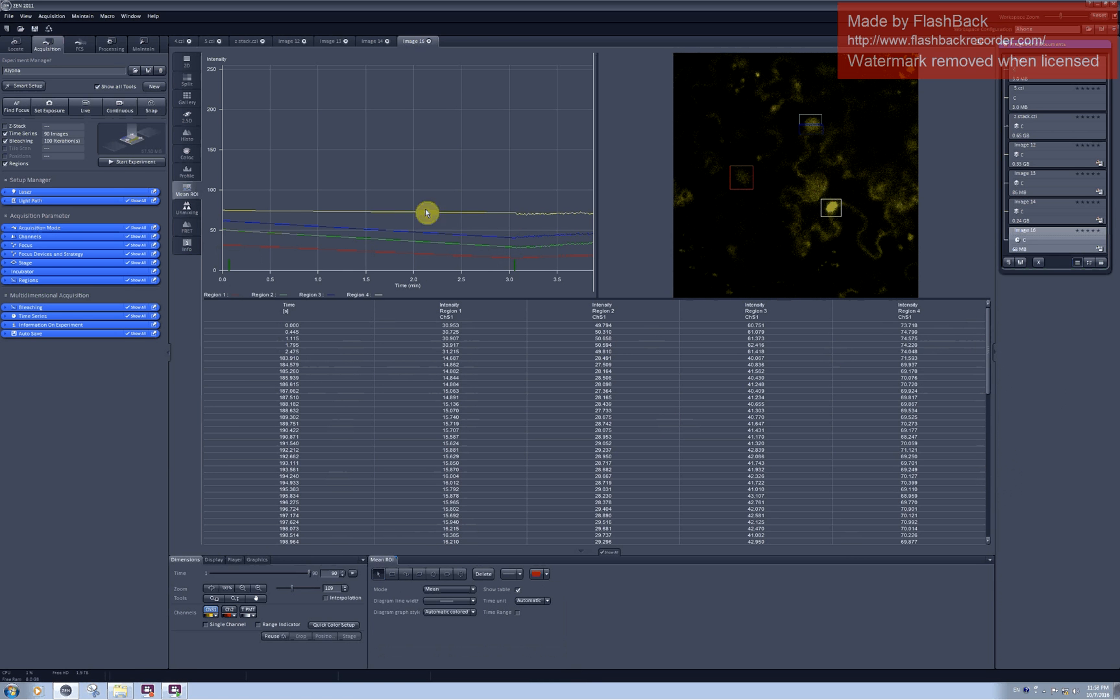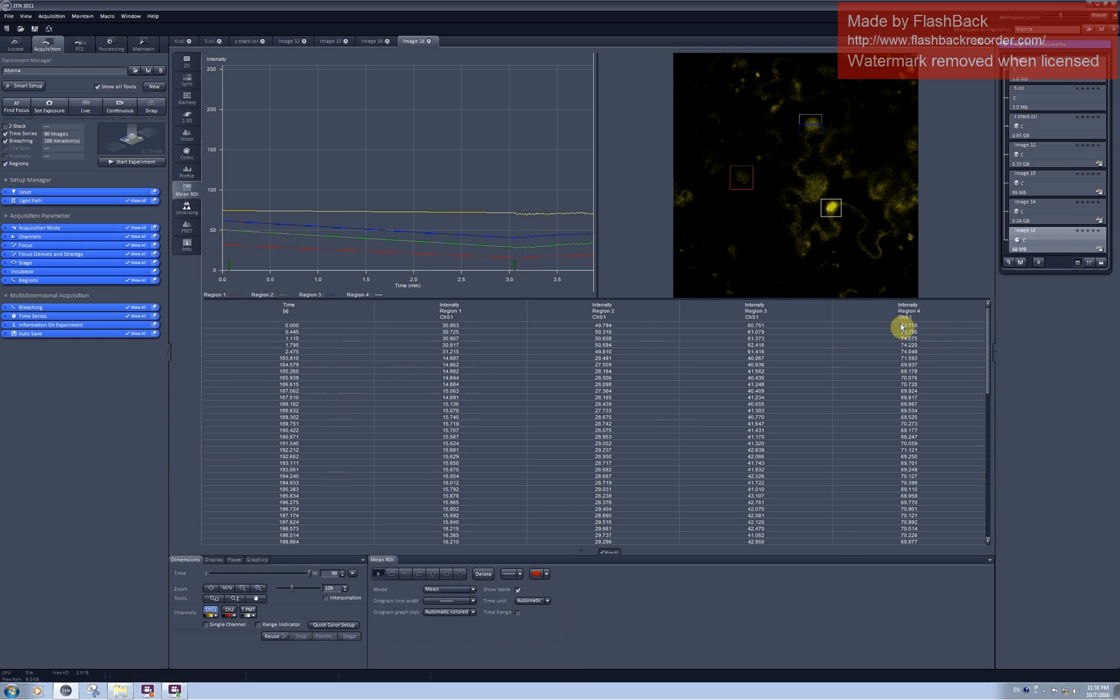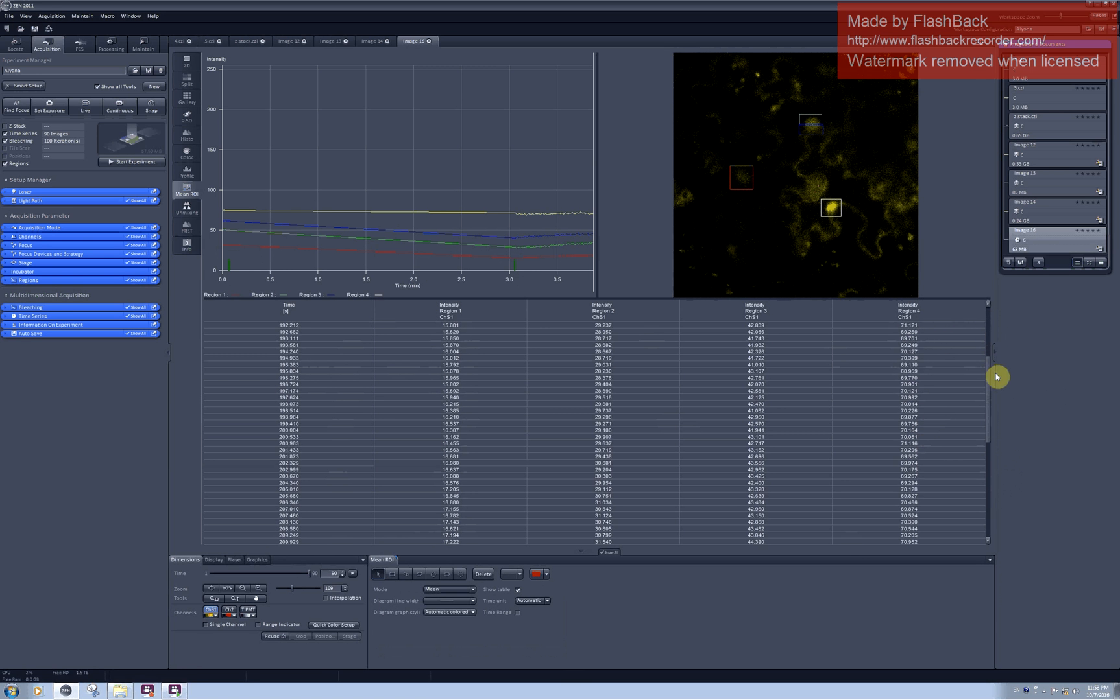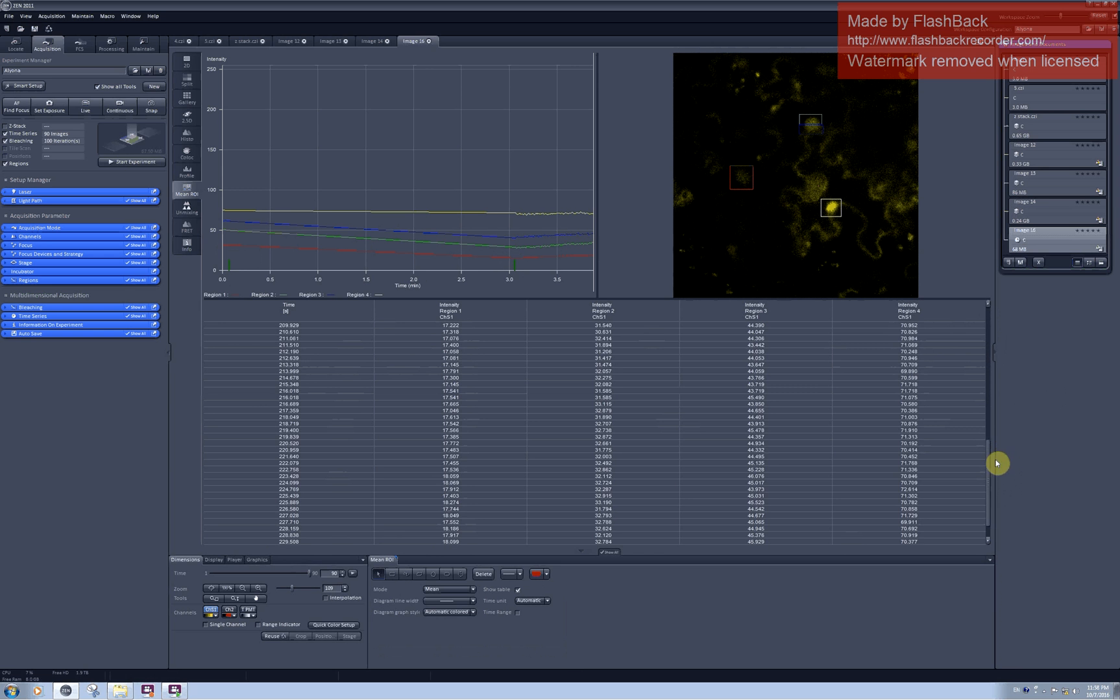While in the non-photobleached region I had intensity around 70-something. And during the scanning it dropped down a little bit, but not significant.